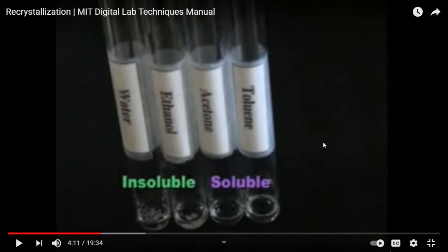This is more detail, okay? Not completely dissolving, none of them at boiling at the second stage from the chosen solvents from step 1. But then you are looking for the better dissolving one. At least you can choose the best one. Maybe not ideal, but you can choose the best one.